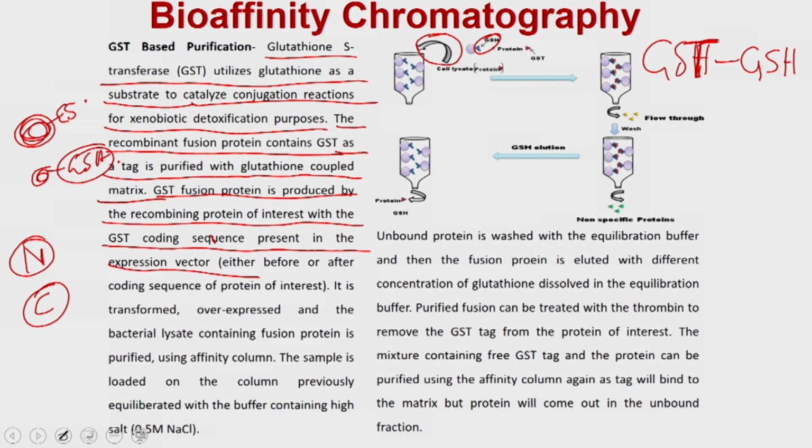So the protein containing the GST tag will interact with the GSH present on the beads, and that is how your protein is going to bind.